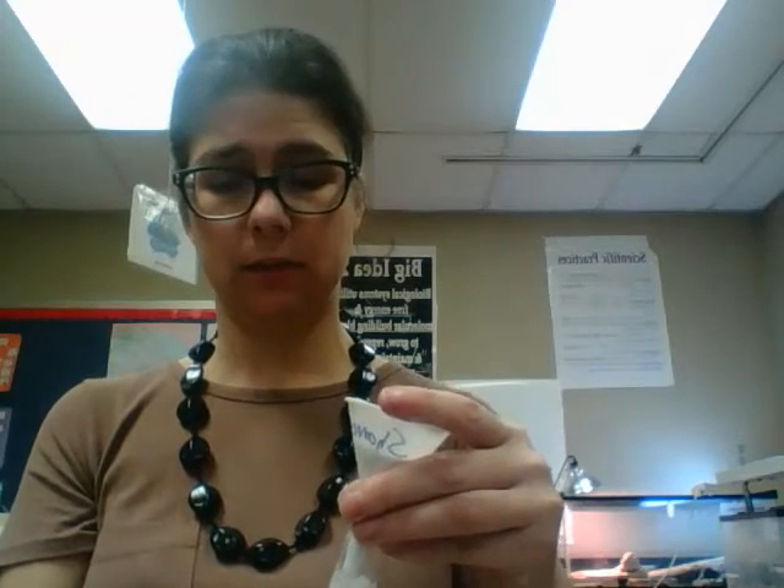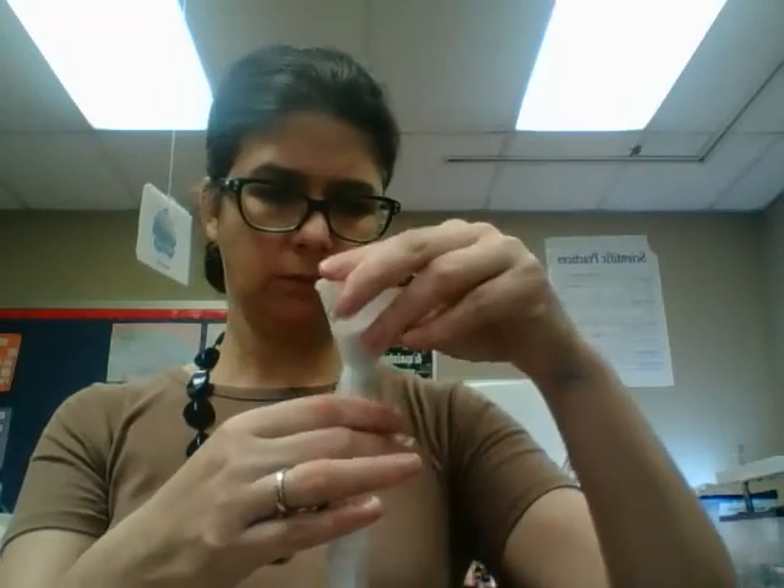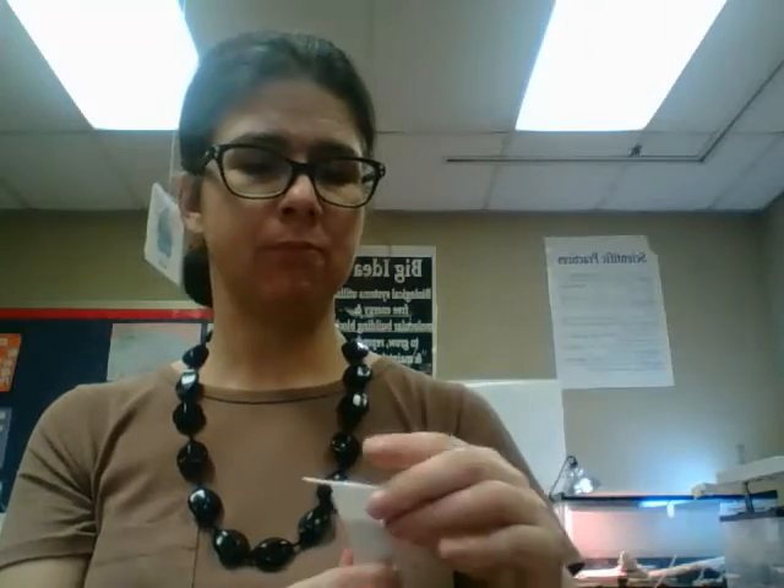If the dialysis tubing gets too dry, it's going to dry out and become brittle. If that's the case, return it to the water and take another piece. The cornstarch will make little clumps up there. When you've got a good amount in, just kind of tap it at the top to let it go down — but don't tap too hard. We had someone in one of the classes who tapped it so hard it flew back on her, so be careful with that.